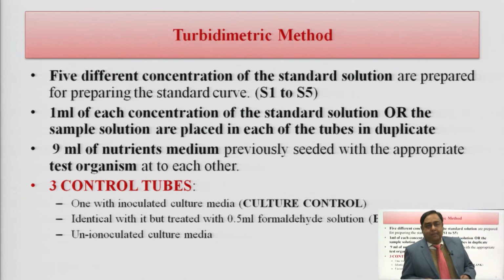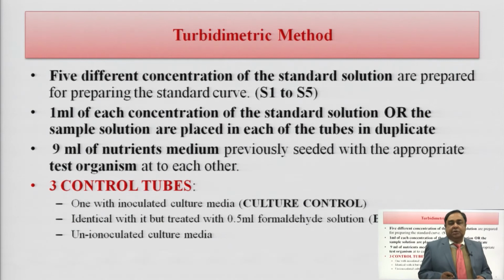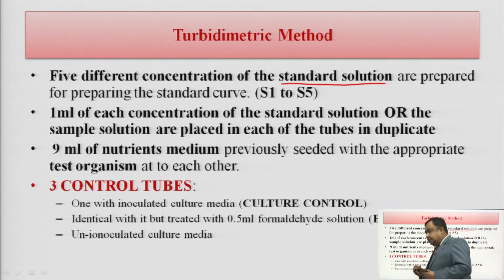Now, whenever you are preparing 5 different concentrations, we have to take the pure drug. That is the reason why we are calling them standard solutions. There should not be the presence of any impurity. For example, if we want to test erythromycin, we have to take the erythromycin reference standard.